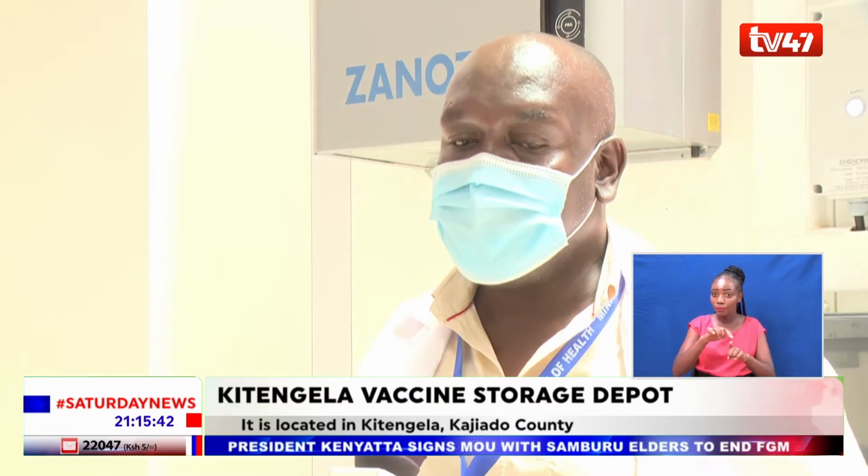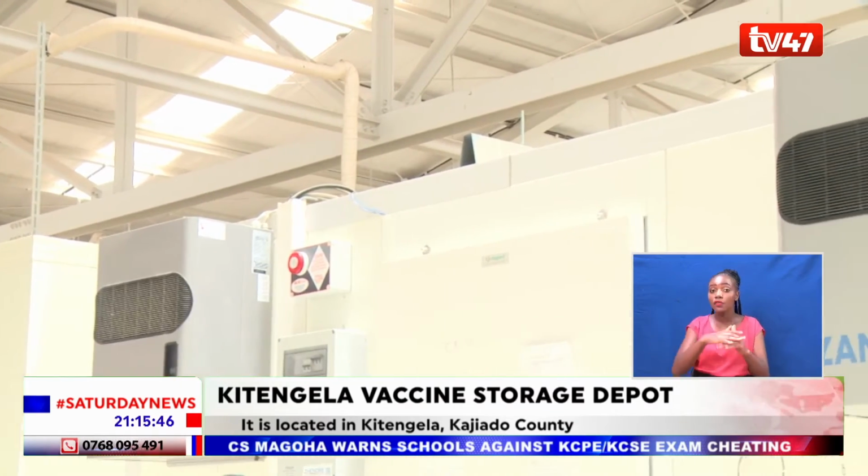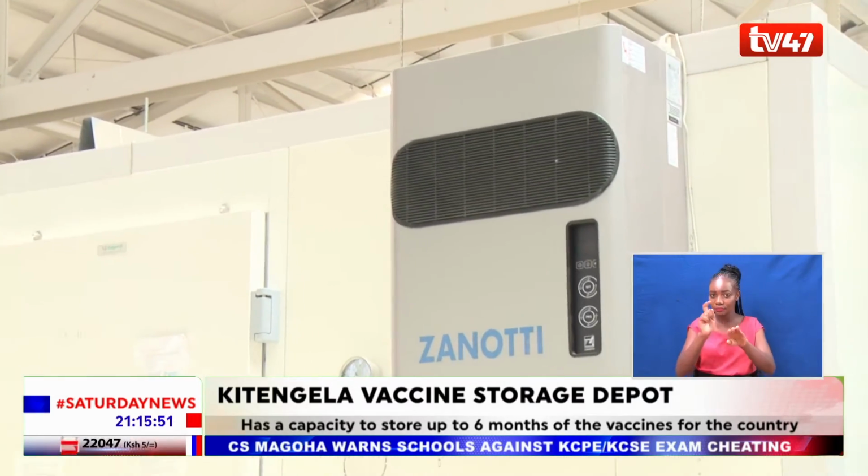And when there's an alarm condition, that is when the temperature moves out of +2 to +8, then it sends us an SMS notification. At the same time, it also sends us an email.